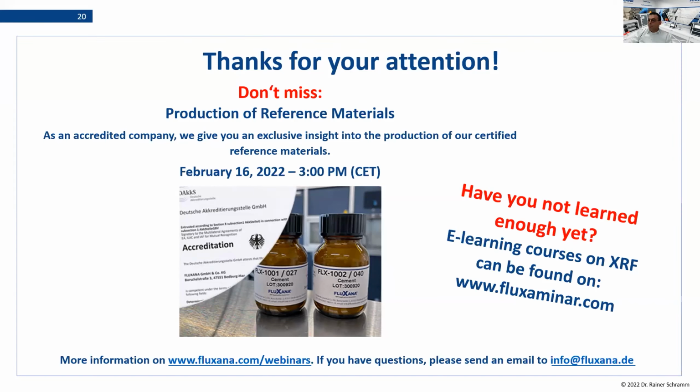Then what would be the sample preparation procedure for plastic samples? Plastic has the disadvantage that if you put it in a grinder, it starts to smear. If it's getting hot, it starts to melt. So probably you need to use liquid nitrogen to make it brittle so that you are able to grind it down. Then you can make a classical press pellet. Or if you can melt it, a hot press would be even better. That would be the sample preparation I would recommend.